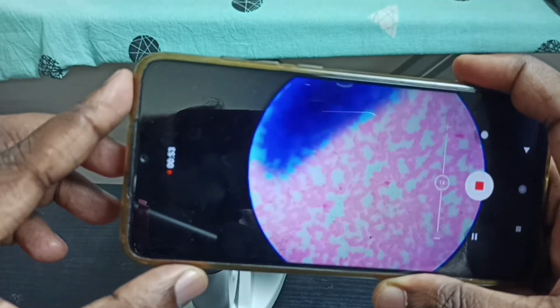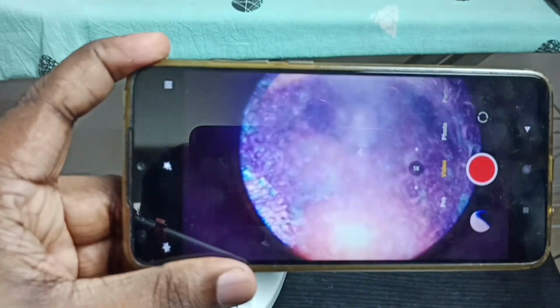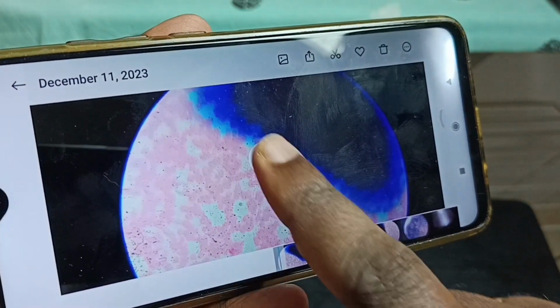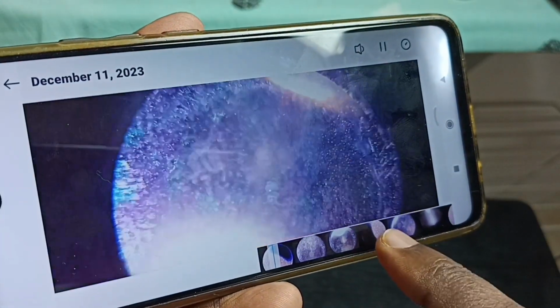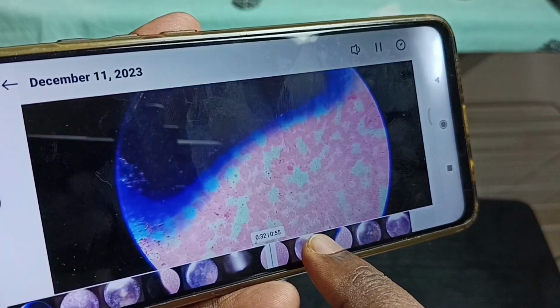So I hope you have enjoyed this video. Let me stop the recording and check the video. So this is the video which I recorded. Let me play this. See.